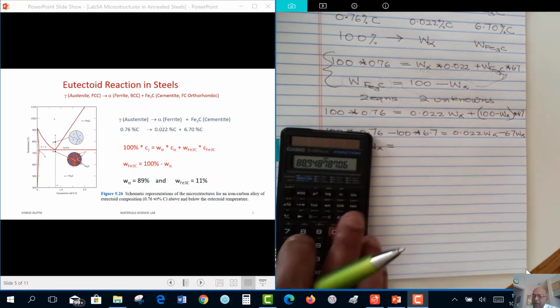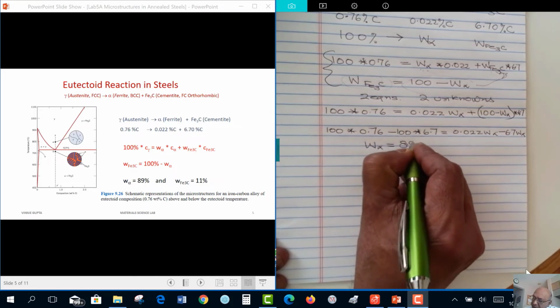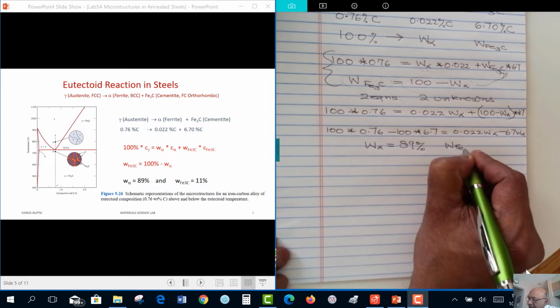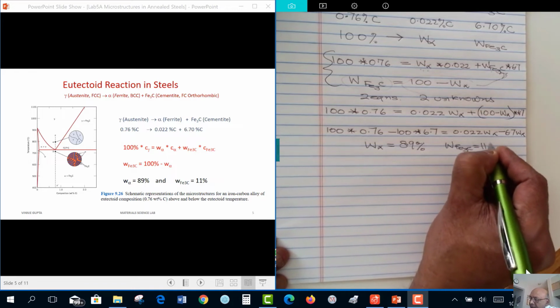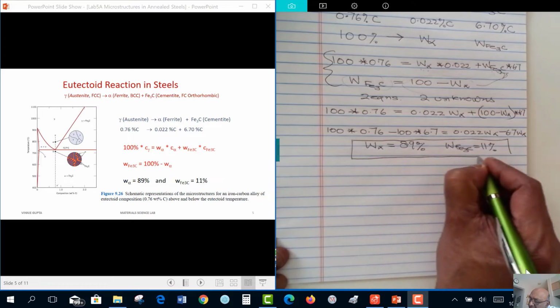And I'll get 88.9, which I'm going to round up to 89%. So our Fe3C would be the remaining 11%. So that's the answer we get.